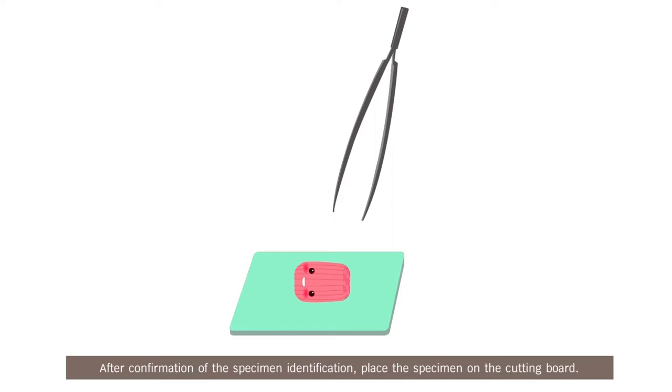After confirmation of the specimen identification, place the specimen on the cutting board. For electron microscopic evaluation, cut the fresh muscle along the muscle fiber with a width approximately 1 mm. The main part will be used for freeze fixation.